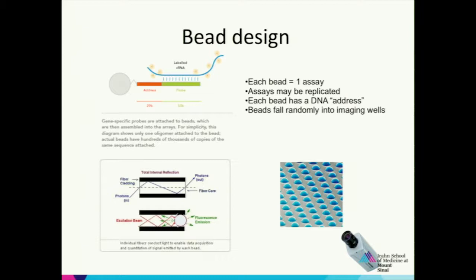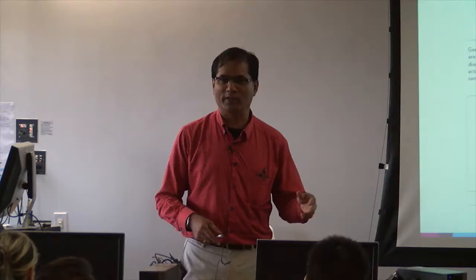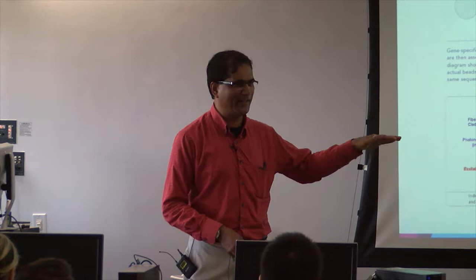Either you can detect the newly expressed genes, or the genes which are already expressing, they are overexpressing, or the genes which are already expressing, they are underexpressing. Right? Clear? It's highly dependent on the wash step. Yes, because there's not like a coincidence detector for double-stranded structures. Yes, we'll come to that. See, every technique has plus and minus, so we'll understand the benefits of this technique.